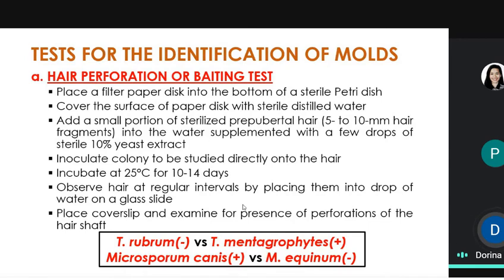Okay? Kasi dyan nga, kung ma-penetrate niya yan, which will be shown in the succeeding slide, siya ay si mentagrophyte. Now, going back to your first, bago ko lang makalimutan, medyo nag-consider ako with the labeling. But next time, hindi pwede yung nilagyan mo siya ng, meron siya ma'am, spiral hyphae, pero meron pa siyang ascospore, meron pa siyang ganito, na hindi naman pwede nandun lahat sa slide.